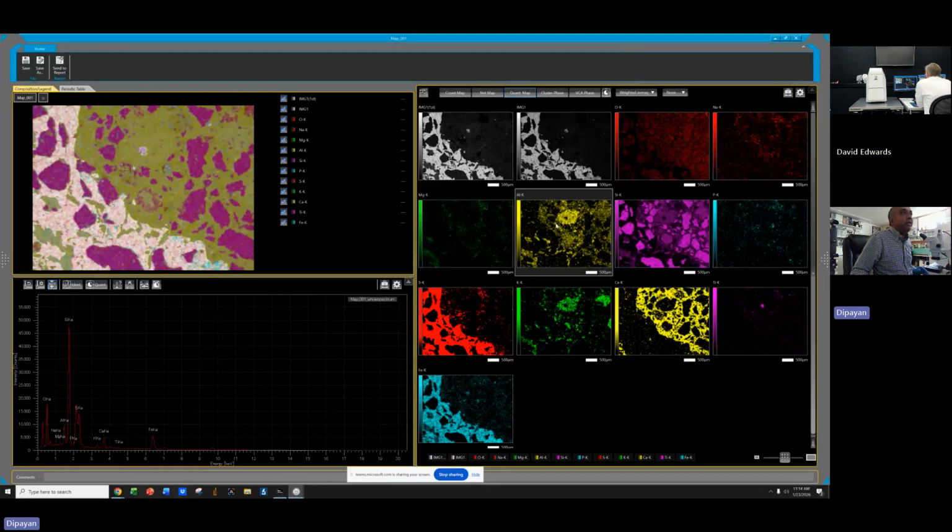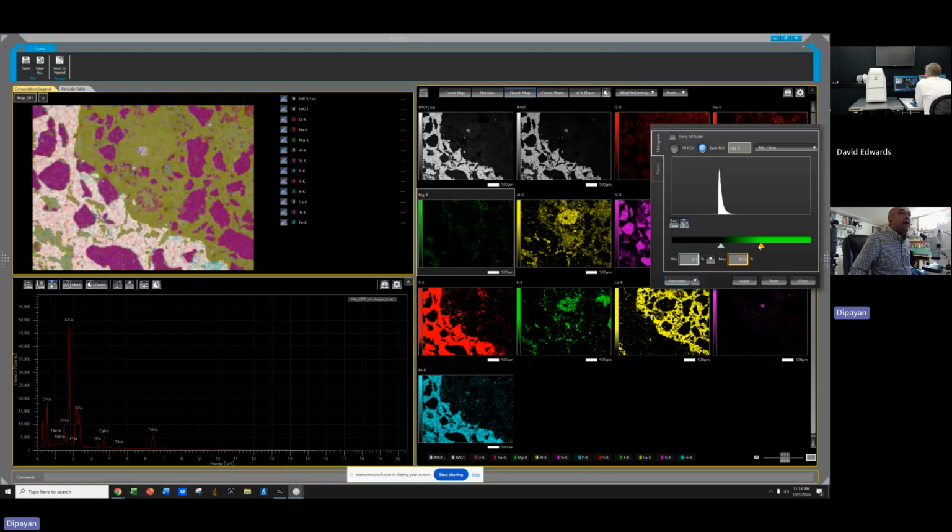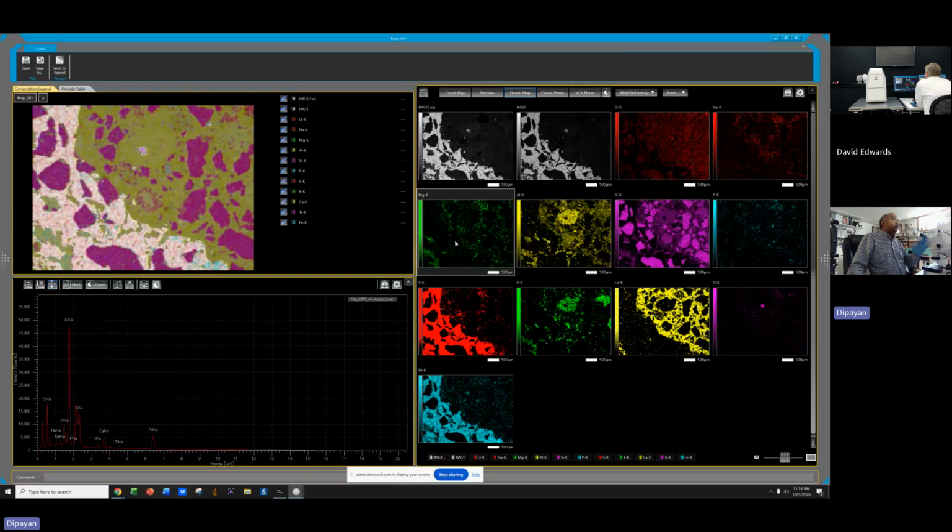As long as I showed my point that these are different phases, separated. Like this one, for example, magnesium is coming from dolomite. So I would rather stay in the weighted average and play with it. So I am on the right track when I'm doing this.